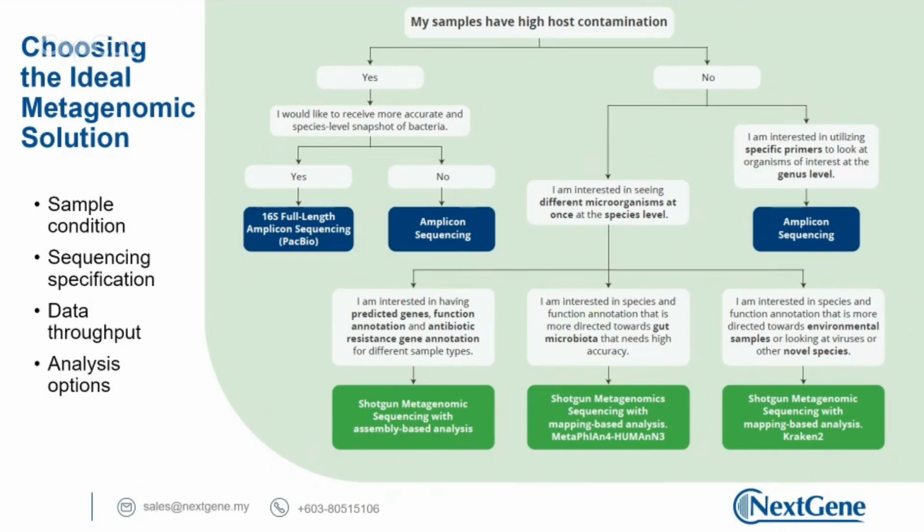are involved, and whether they are showing certain phylogenetic relationships or sharing some ancestral information from one sample to another sample. So more information can be obtained from shotgun metagenomics sequencing, but the cost will normally be slightly higher. So based on the type of sequencing that is used, of course, there are quite a lot of analysis approaches.